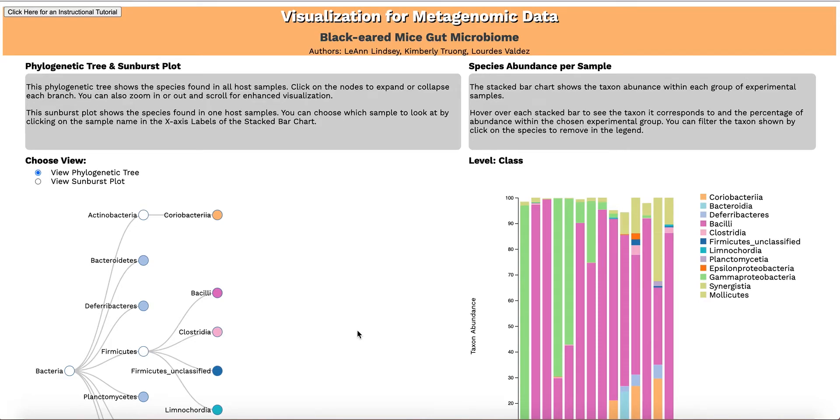Welcome to our Metagenomic Data Visualization Tool. This tool was designed to help researchers explore metagenomic data, which gives information on the microorganisms that are present in a biological sample and the abundances of all genes and gene pathways that are present.